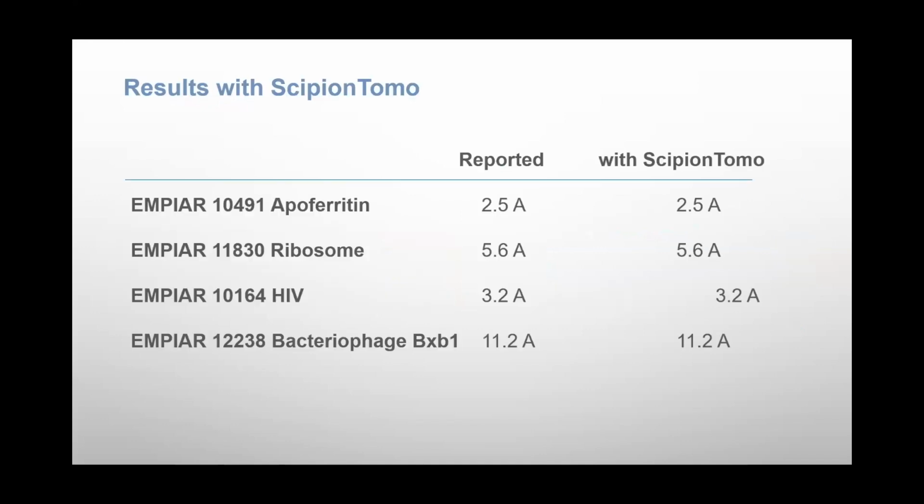So about the results that we can get with this, what we obtain is what is reported in the literature. So if you go to these data sets and you see the resolution, then we were able to obtain the same resolution as the original publication.